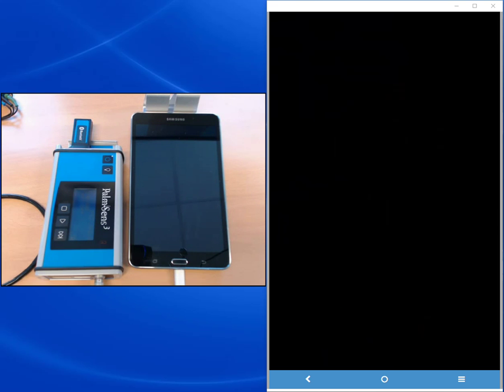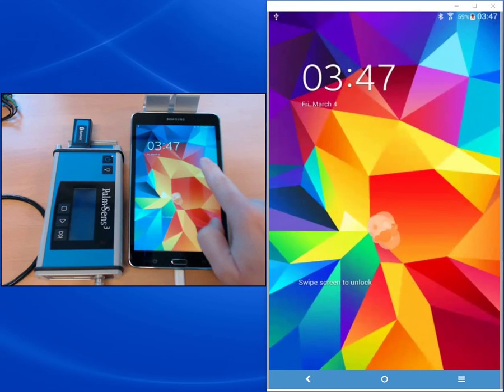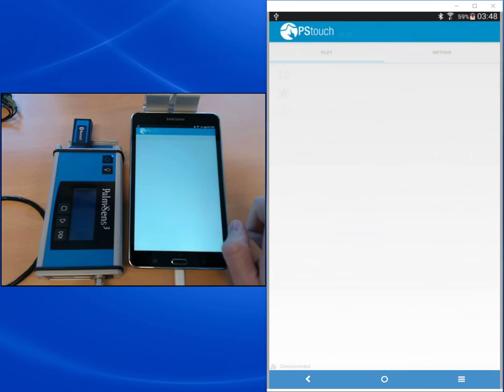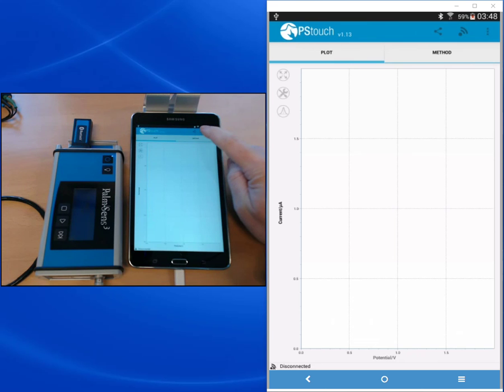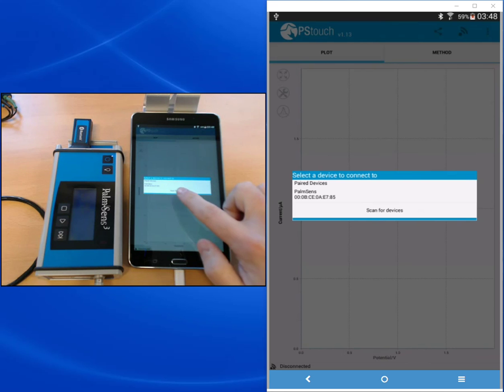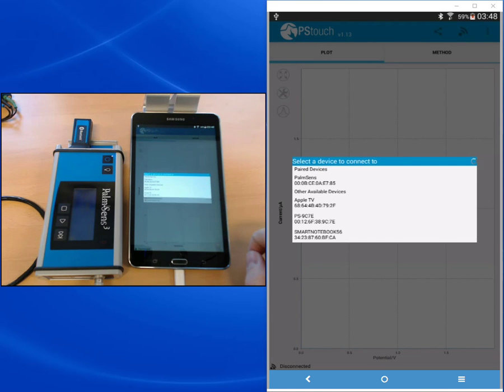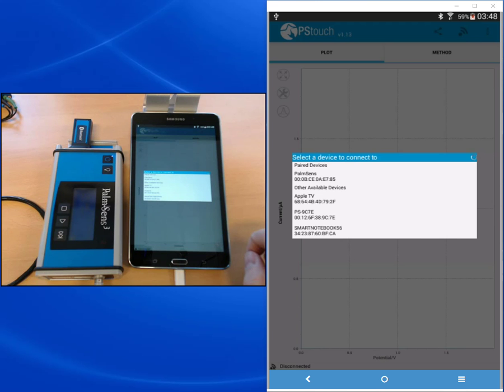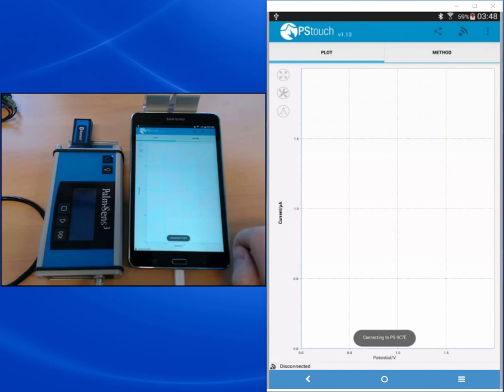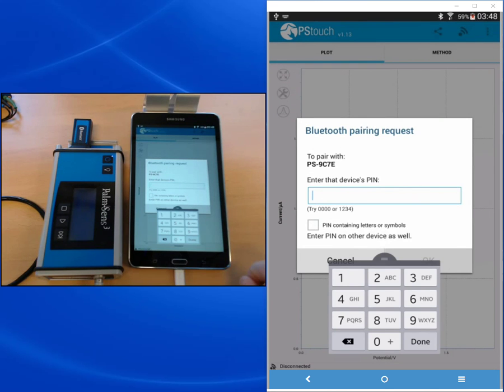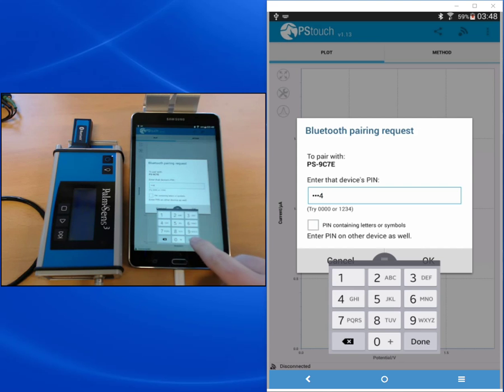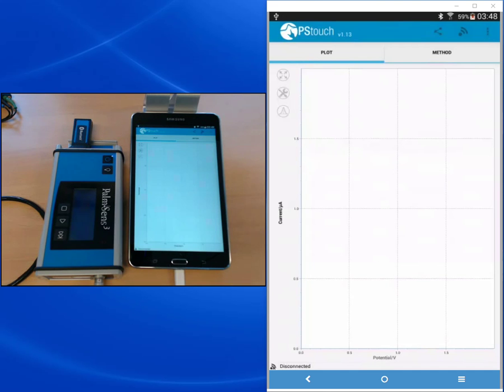I open PS Touch and I press the connect button to connect the Palmsense. The Bluetooth extension is not in the list yet, so I scan for devices. Several devices appear. Thanks to the MAC number, I can choose the correct one and I'm asked to pair, and I can pair the device with the code one, two, three, four, and I'm connected.